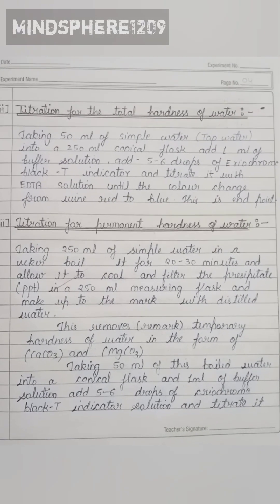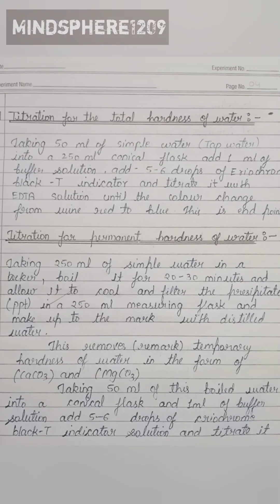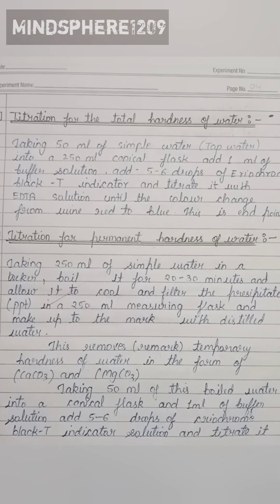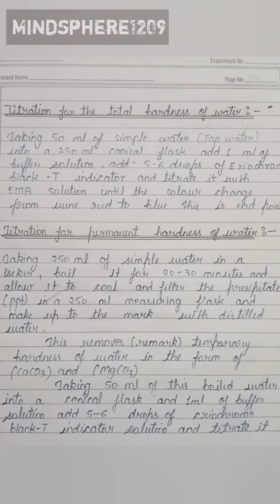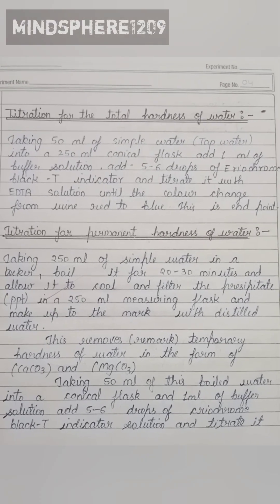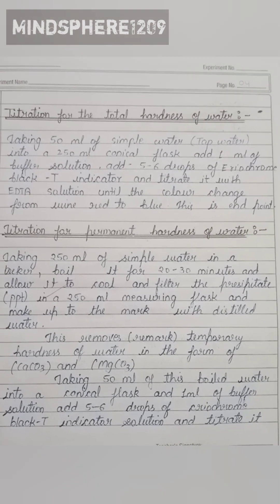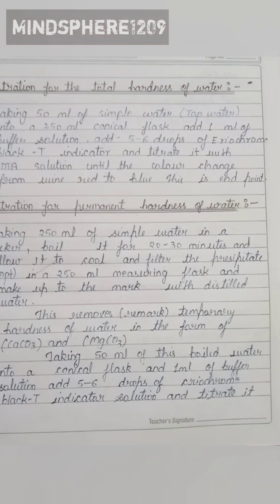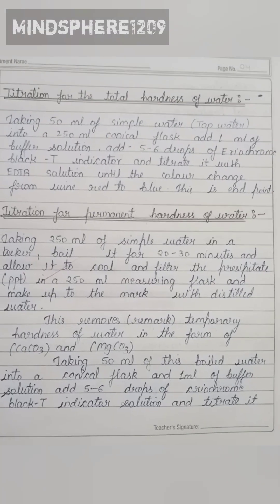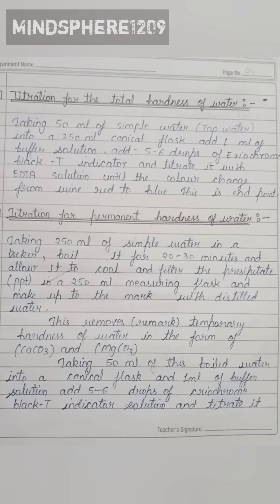In this step, take 250 ml of sample water in a beaker and boil it for 30 minutes. Keep it for cooling, then filter the precipitate into a 250 ml measuring flask and make up the mark with distilled water. This step removes the temporary hardness of water in the form of calcium carbonate and magnesium carbonate.